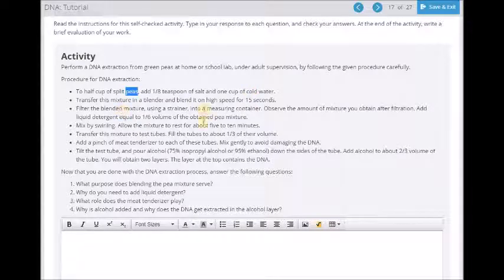I think you're going to need some laundry detergent and maybe some isopropyl alcohol. Isopropyl alcohol is the white bottle that's 95 cents at Walgreens. It's like what the nurse will rub on you that smells funny just before the doctor gives you a shot. That's isopropyl.